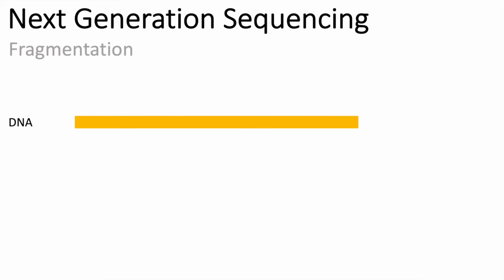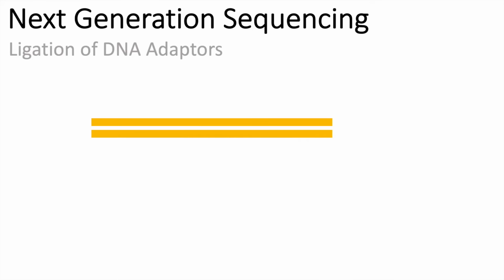We start with the sample preparation. Once we have isolated our DNA, we need to generate smaller fragments. Now all of these DNA fragments will get ligated to certain oligonucleotides. There are two types here. These include sequencing binding sites and also an additional complementary sequence which can then hybridize to the flow cell.